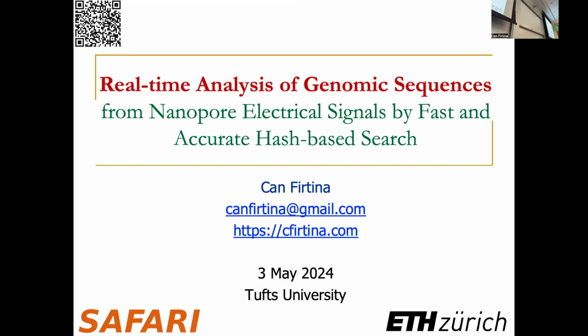But then the next question is, if you're getting a large chunk of data, assume you're getting 3 seconds of data, then you're basically bounded by making your earliest decision at the 3rd second. The question is, maybe you could make your decision much earlier, maybe in the 1st second or in the 2nd second.